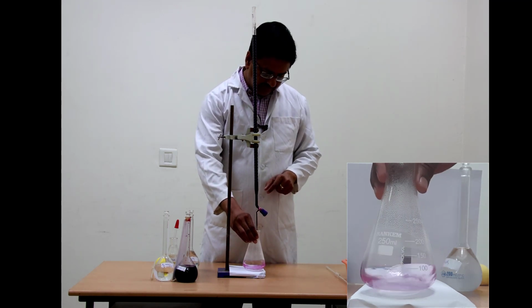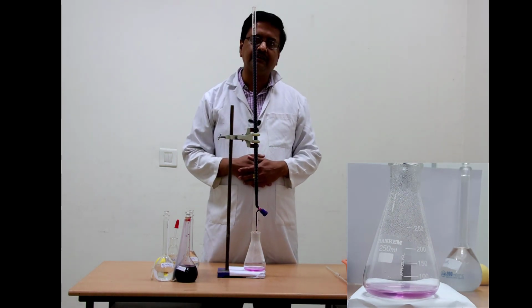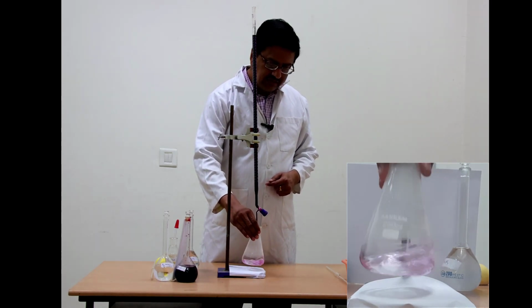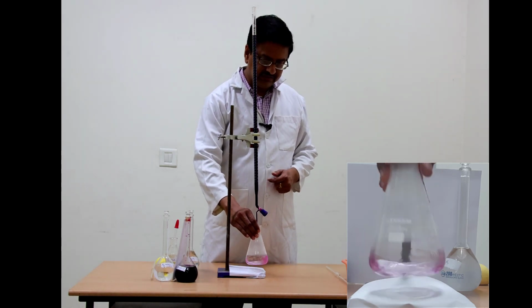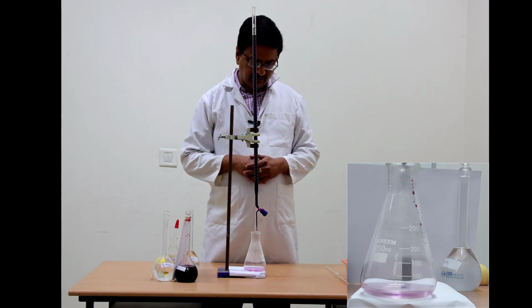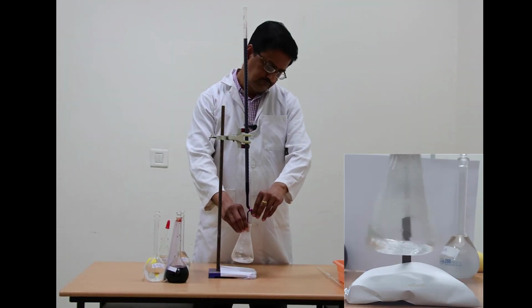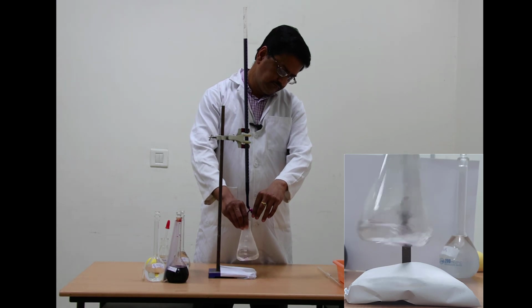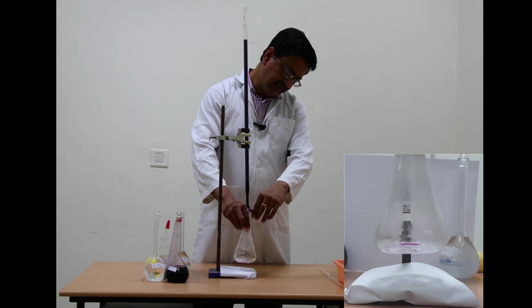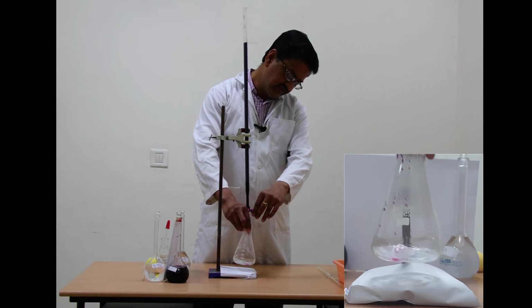You see that on addition of this first drop of potassium permanganate, the solution contains a faint pink color, and this faint pink color persists for a while, because this particular reaction between permanganate and oxalic acid is slow. As a result, this decolorization takes a long time. Now you can see that the color of permanganate decolorizes immediately as soon as it falls in the oxalic acid sulfuric acid solution.